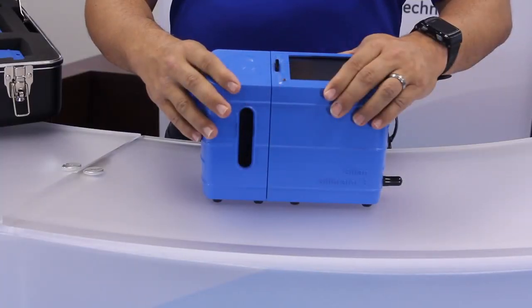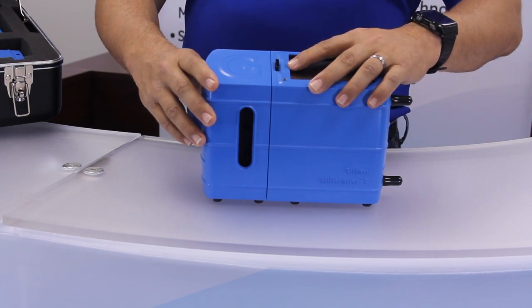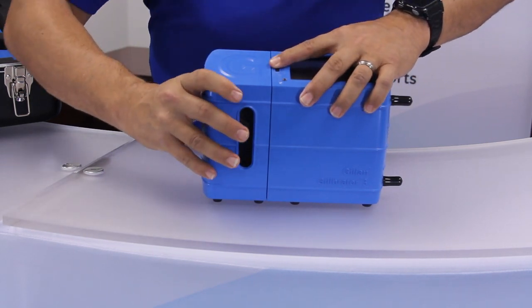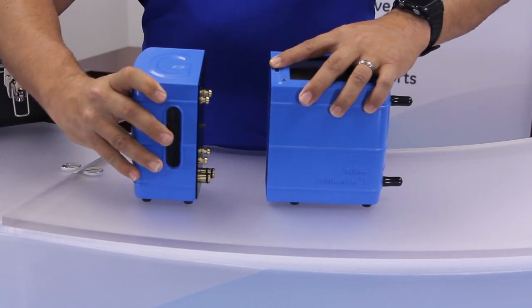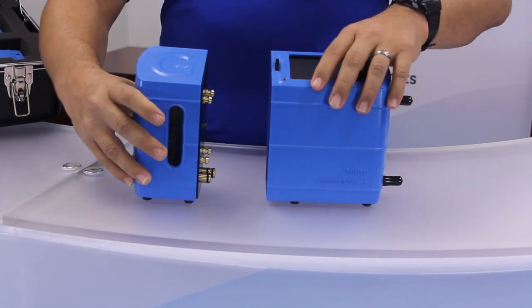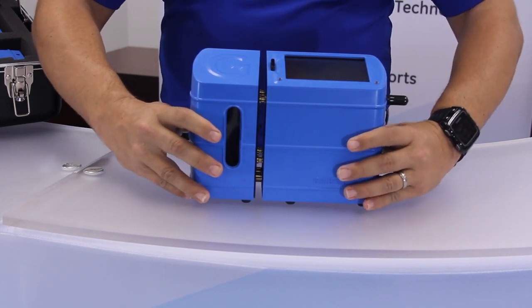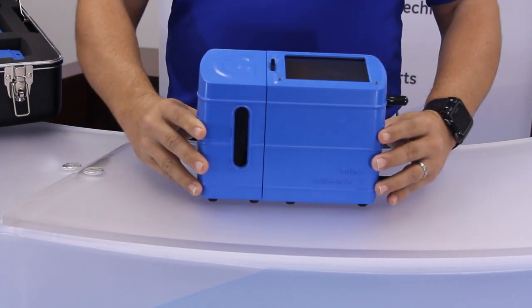To attach and detach a flow cell from the base, press down firmly on the cell release button here. With your other hand gripping the side, pull horizontally away from the base. To connect a new cell, simply align the connectors on the flow cell with the openings on the base and gently push in horizontally until the cell snaps into place.